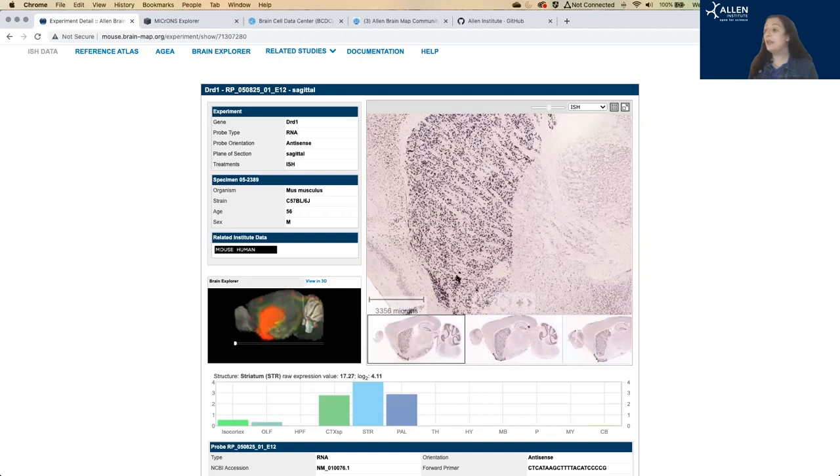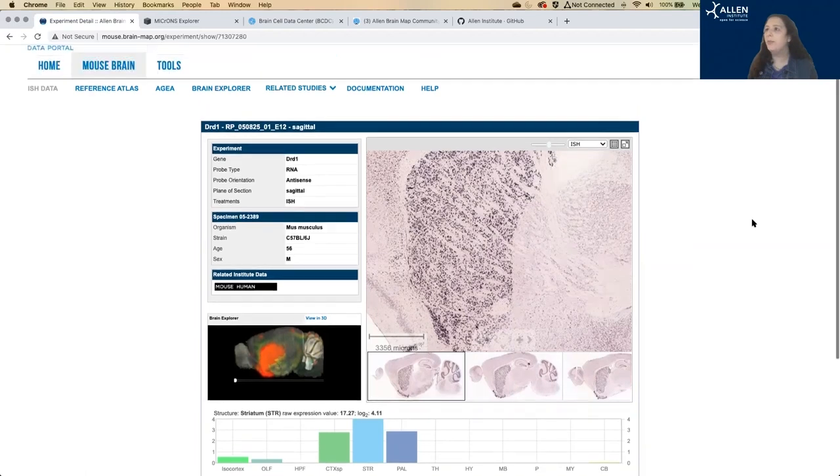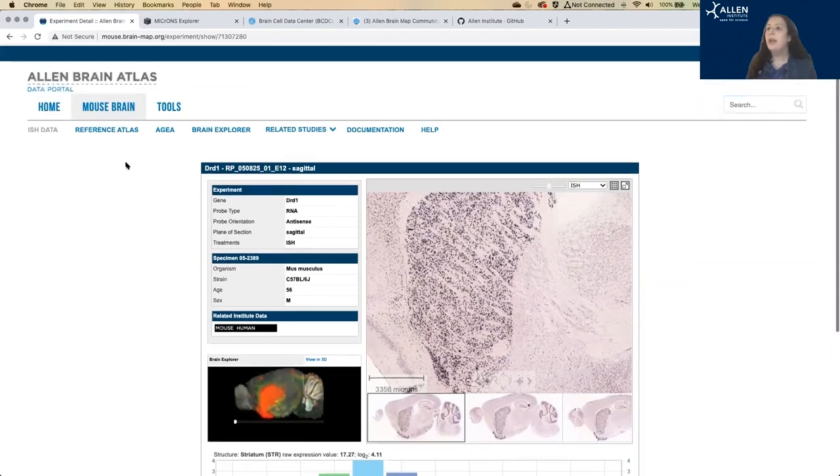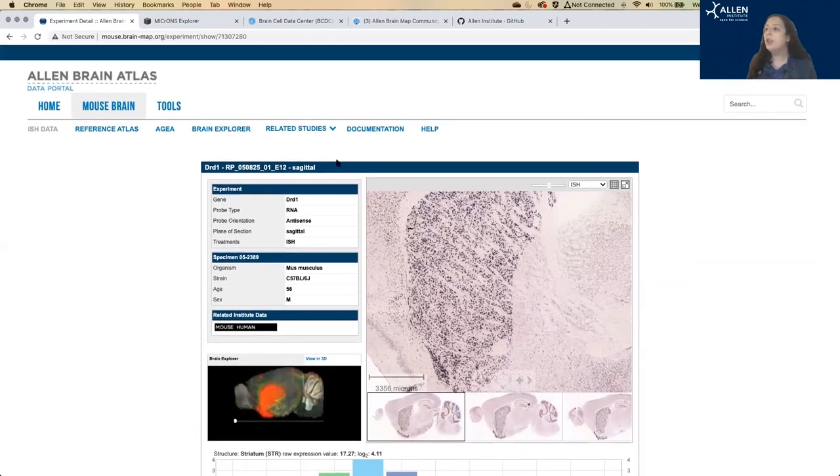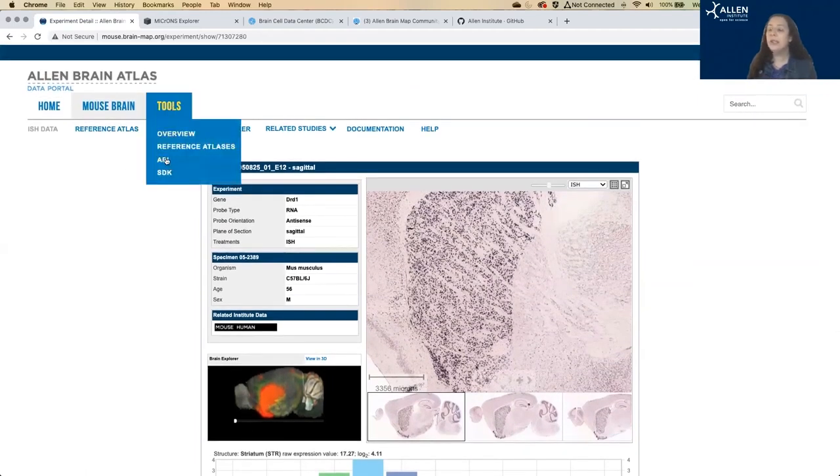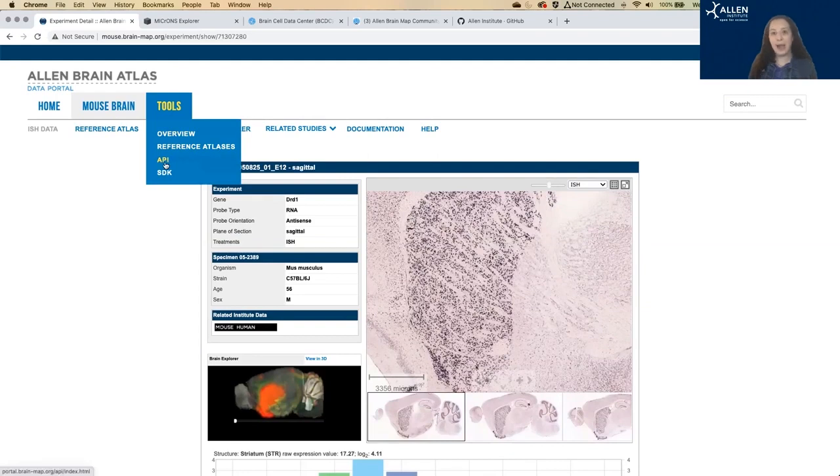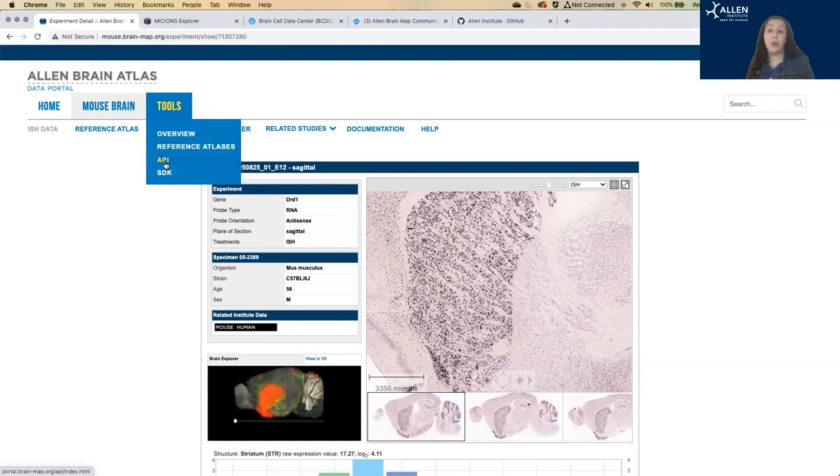You can download these ISH images from this page. Or if you want to download more than a couple of genes worth, if you go up to tools, it will take you to the API. And that will give you instructions on how to download these images in bulk using an API search.